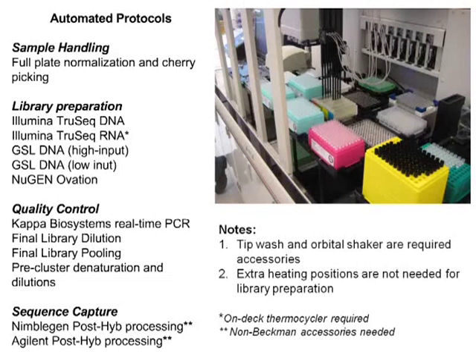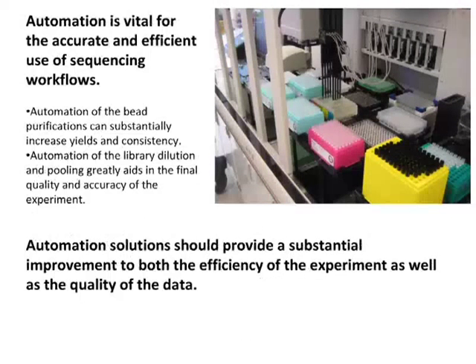But I did want to emphasize that everything you see on this current slide was developed or largely developed prior to the SPRIworks HT. We actually find that the SPRIworks HT and many of the things I'm showing here are quite complementary to each other, and we routinely interchange between them, and I'll make some further comments on that in some further slides.